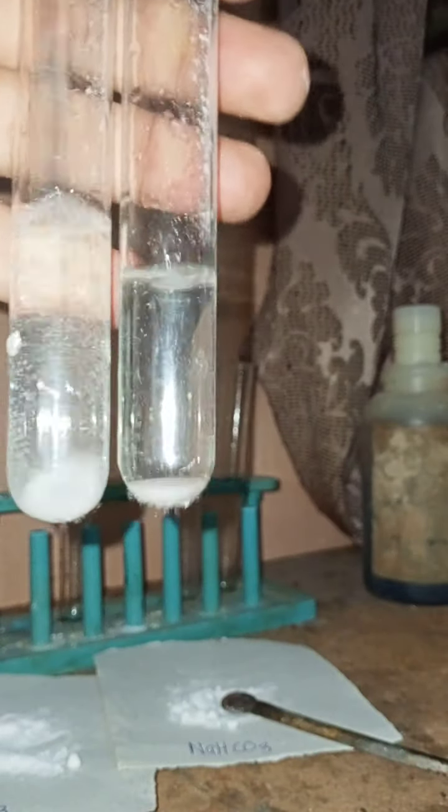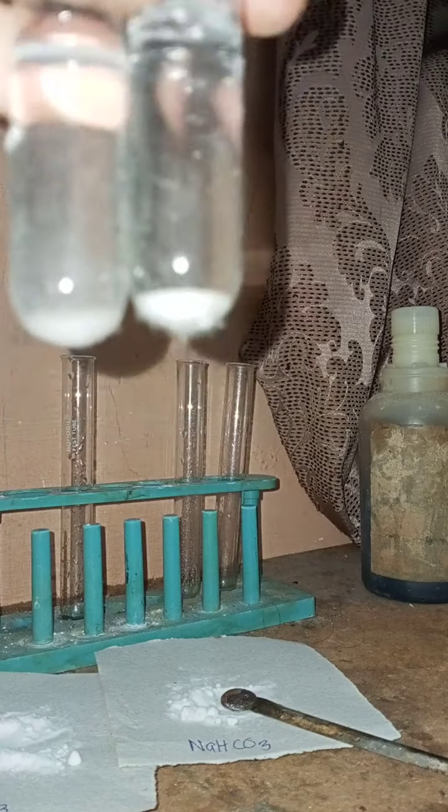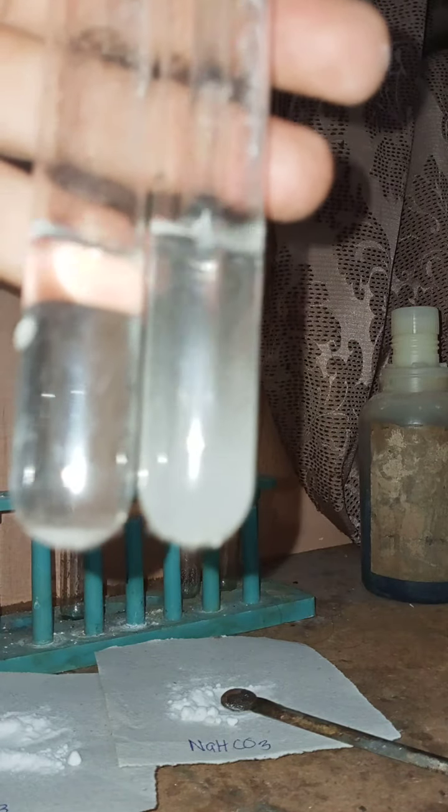For that I am going to use a glass rod to mix both the substances. You can see how they are being mixed. So now we have the solution of sodium carbonate and sodium hydrogen carbonate, that we shall place aside.